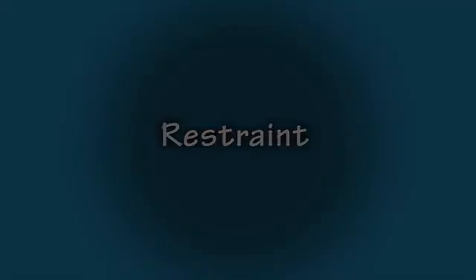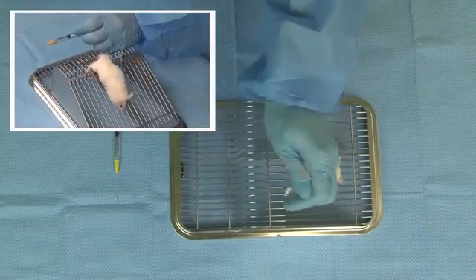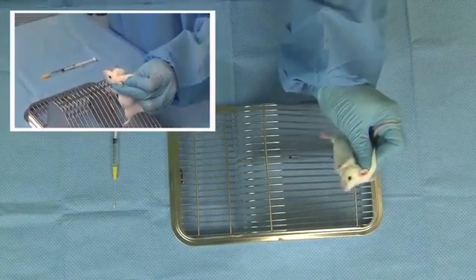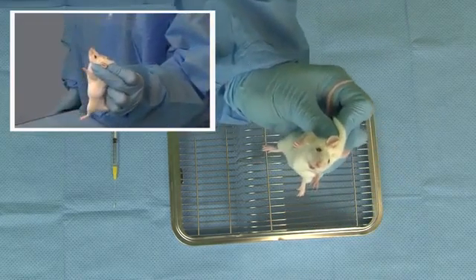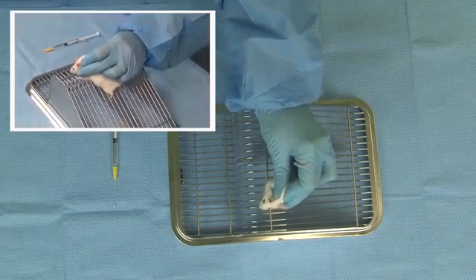Now we will address restraint of the animal. Proper restraint is the most important part of a successful gavaging procedure, critical for both the safety and comfort of the animal and the safety of the technician. Gently but firmly grasp the mouse by the base of the tail. Then use the thumb and index finger to gently grasp the nape of the neck, holding the mouse by the scruff. Confidently lift the mouse by the scruff and hold it in an upright position, ensuring the mouse cannot use its back legs for leverage.